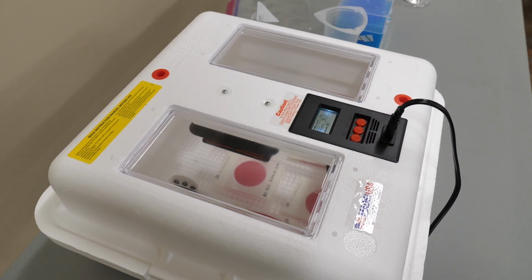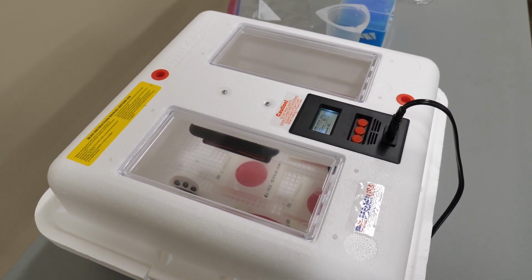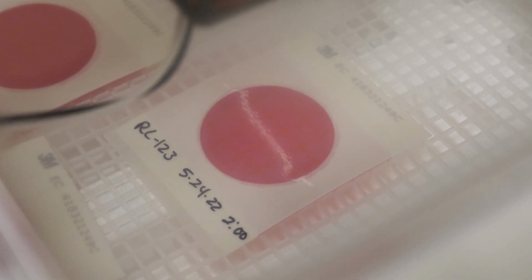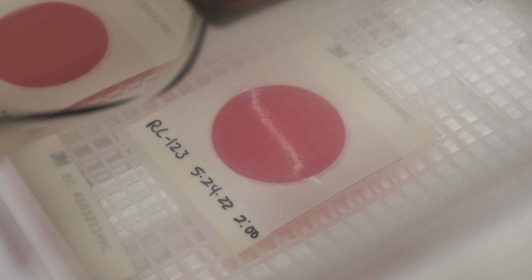Bacteria samples need to be incubated for 24 hours, plus or minus 1 hour, before reading the results, which means you'll need to plan the date and time of your sampling event for when you know you'll be available to read the results 23 to 25 hours after beginning incubation. For example, if you plate your sample at 2 p.m. today, you can read your results between 1 p.m. and 3 p.m. tomorrow. Always record the data as soon as possible in the database and be sure to enter values for each plate incubated.